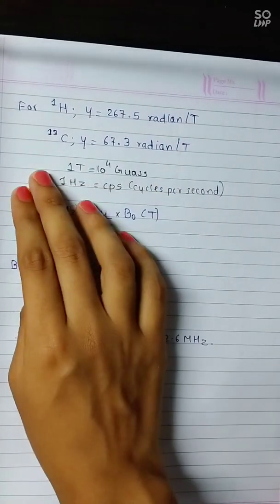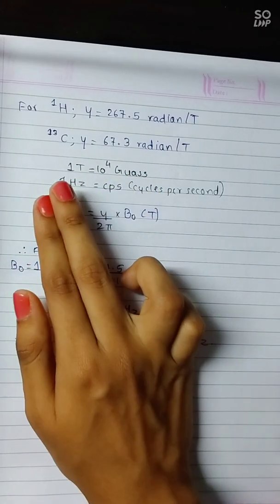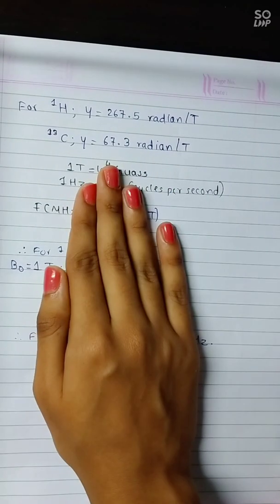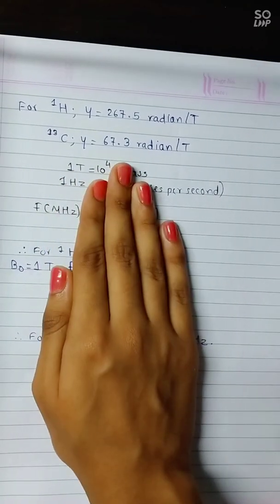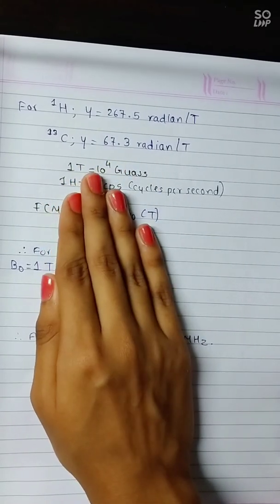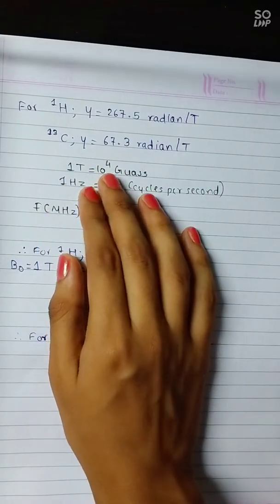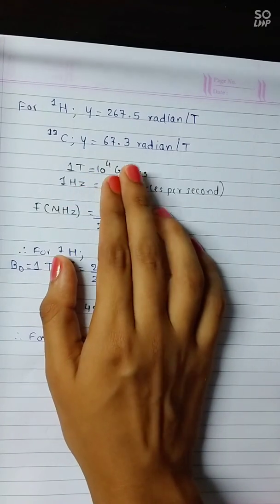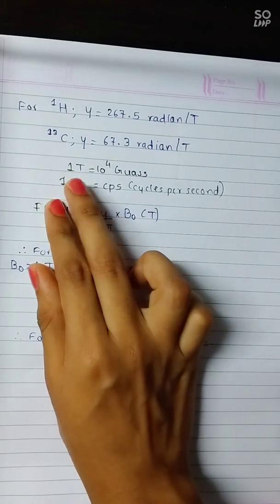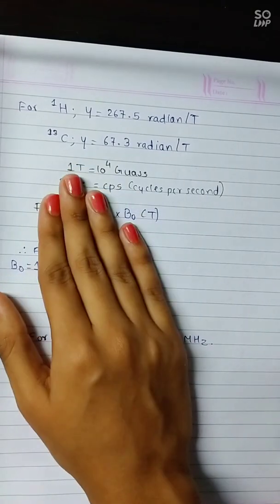Also, there are some basic things which we need to know. 1 Tesla is 10 raised to 4 Gauss and 1 Hertz is equal to 1 cycle per second. This is very important because if we want to go deep into NMR, we need to understand these basic things. Also, note that whenever we talk about magnetic field in NMR, it is always written in Tesla. So you might be given a numerical in which the magnetic field is given in Gauss. At that time, you need to convert it into Tesla. And if frequency is given in Hertz, you have to convert it into megahertz. Fine, we will also solve numericals for the same.